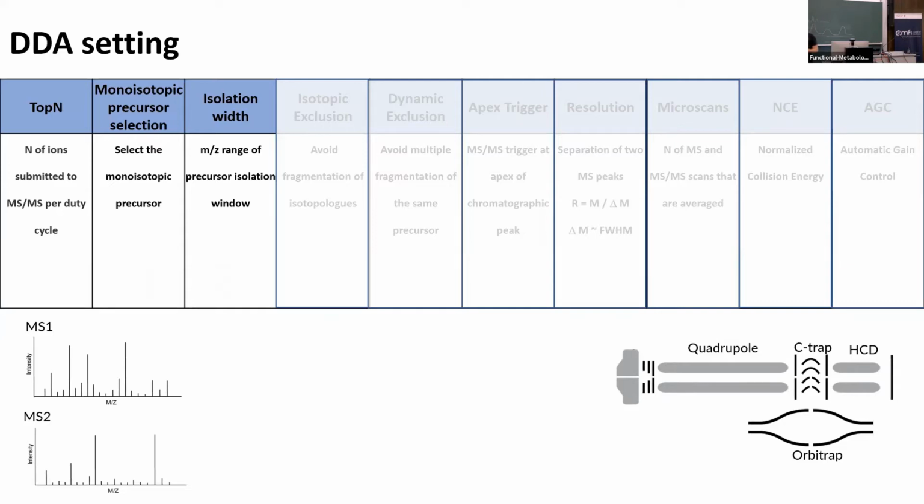And there, I think Bruker may have made a really cool TOF instrument, but at least the Maxis we had available in San Diego did not have a very good quadrupole filter. So by default, you would just need to use that with, I don't know, 5 or even higher isolation width in order to get enough ions in for an MS experiment.